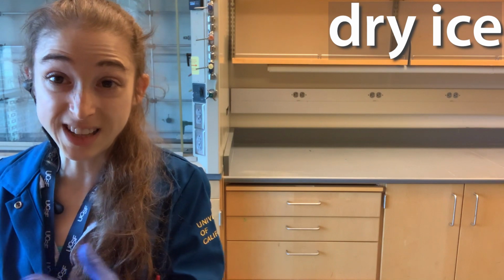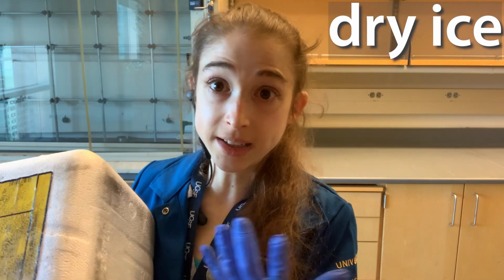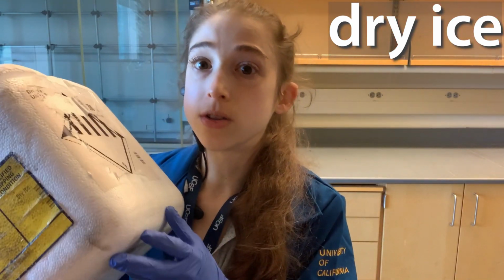It might not seem like there's that much of a difference between your wet ice, your normal ice, and your dry ice, but the dry ice is really, really cold. We can use it to ship samples and keep them at minus 80 degrees Celsius, because dry ice is at about minus 80 degrees Celsius, which is super cold. So if you put a sample on dry ice, do not expect it to be just like putting a sample on regular ice, and liquids that you expect would still be a liquid on ice might become a solid pretty quick. So be careful if that's not what you want. But dry ice is really great if you do want things really cold.